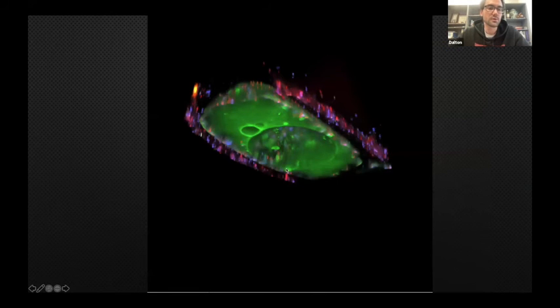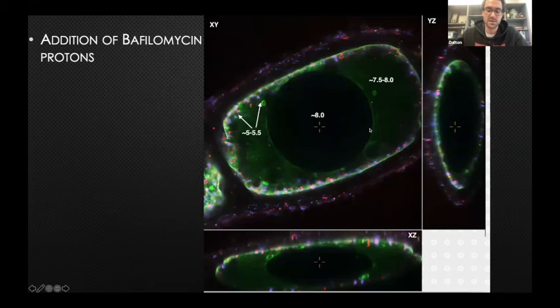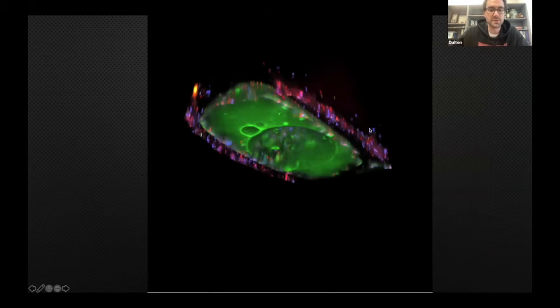And this is just a really cool three-dimensional image of this previous slide. If you just cut it in half, I just thought it was a really good way to visualize this vacuole. And you can see some of these other smaller vacuoles too, outside of this large one here. And then you can see there's additional blebbing into the actual central vacuole too. So it does seem that some of these vesicles are fusing into the large central vacuole there.